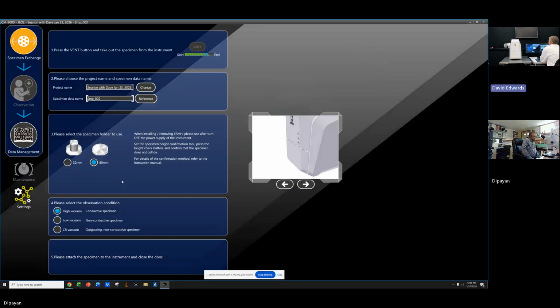All right, so it was a full power down and a computer power down, so that didn't solve it. Nobody played with the cables in the back of the PC? No. Do you want me to go back and see the cables? All the cables are connected, tightly connected. I wouldn't mess with them because they're going to have them in certain places.